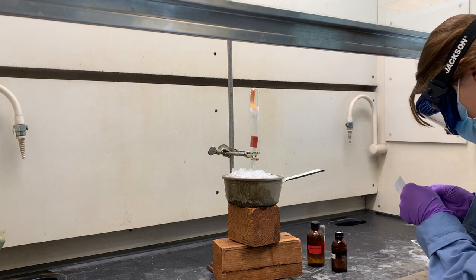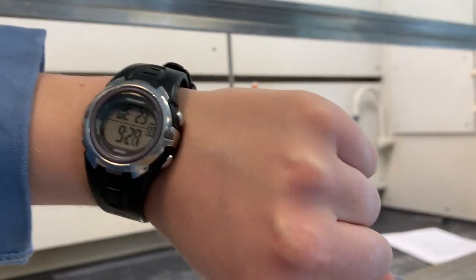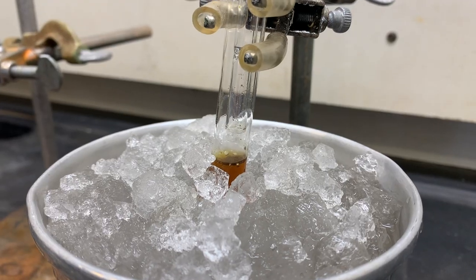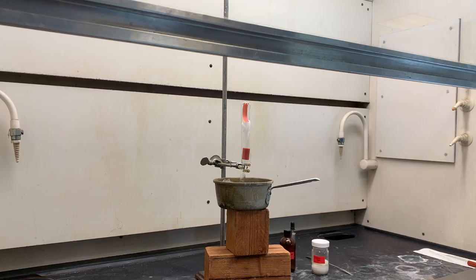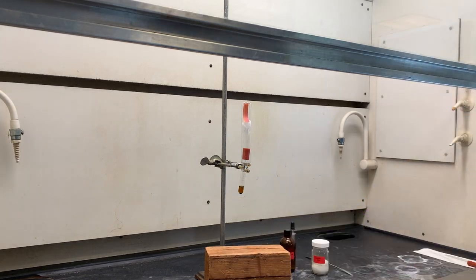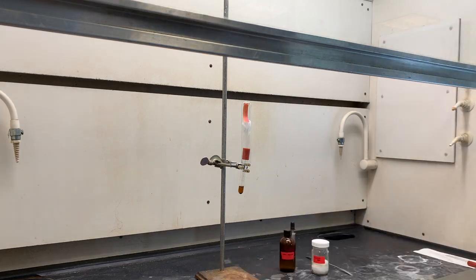Allow the reaction to proceed until the rate of bubbling slows or 30 minutes from the time that vigorous bubbling began. Remove the ice bath and allow the reaction to warm to room temperature. As the reaction is warming, prepare a microfiltration pipette.